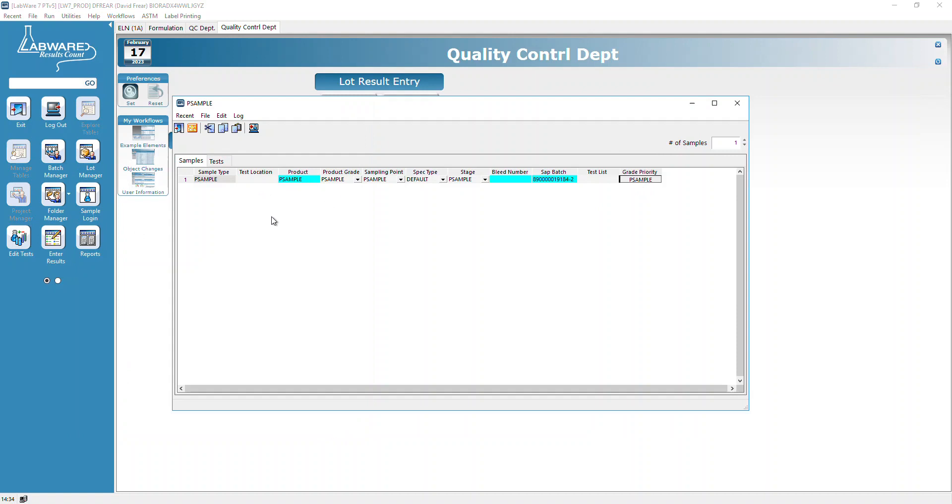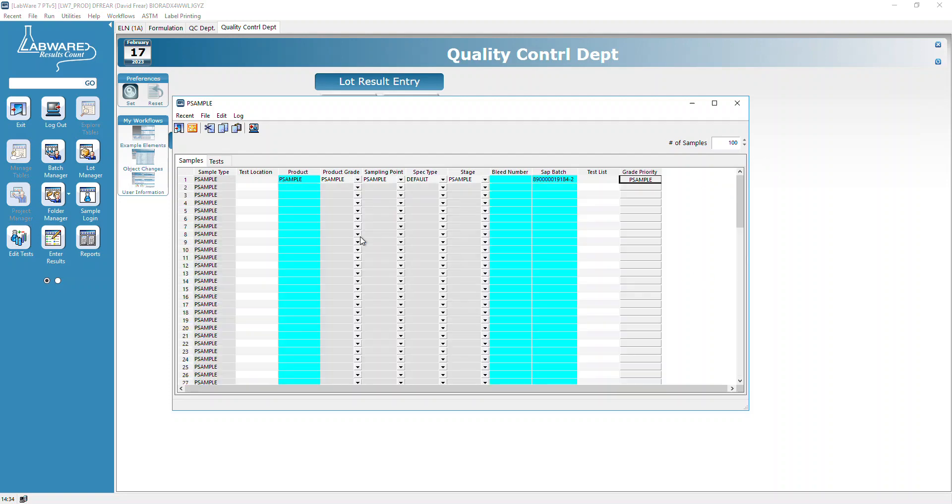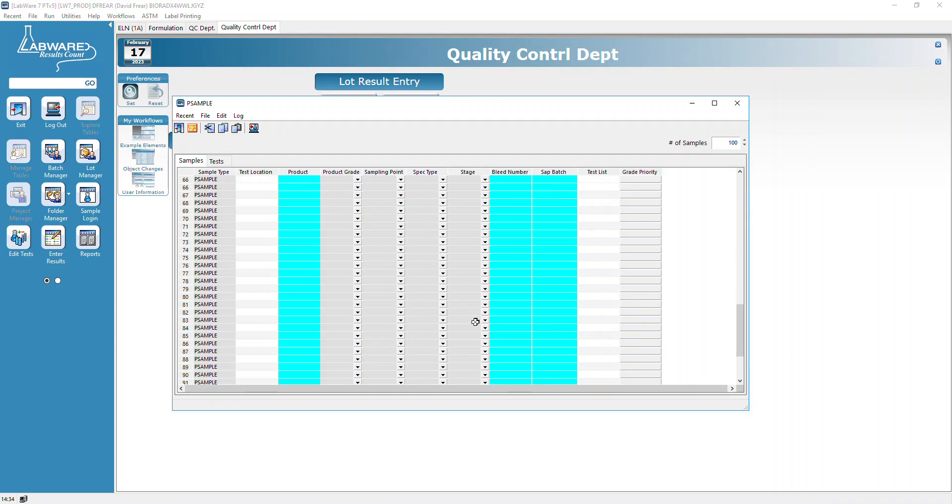At that point, we've got our P sample records set up. Now we're going to log a hundred samples, so we go up to this number of samples to log and type in 100.